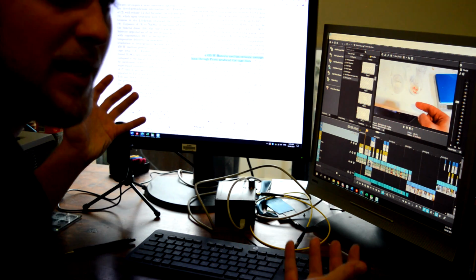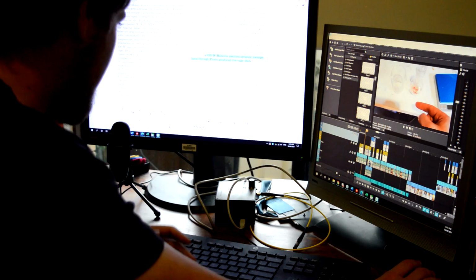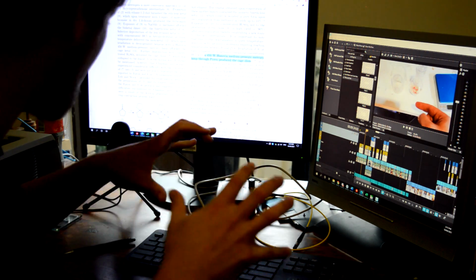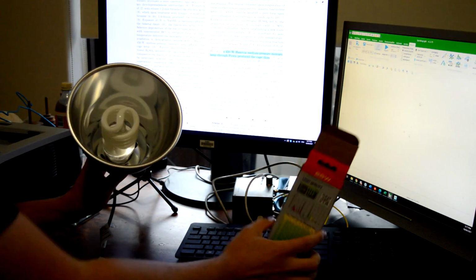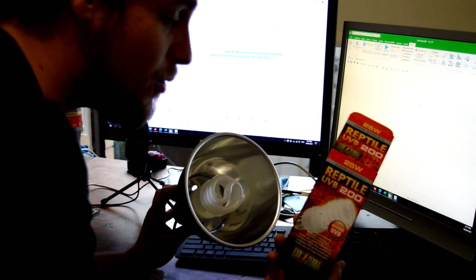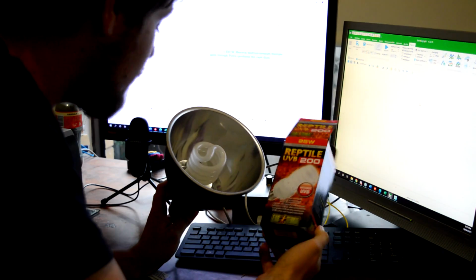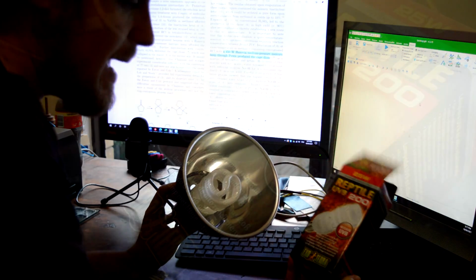So if everyone's using a medium pressure mercury lamp, then I suppose I should be using a medium pressure mercury lamp, but I don't have one. They're expensive. I don't know where I'm going to get one from. I've got a slightly nicer and more available source of UV. This here is a reptile lamp. It's not very high wattage, it's only 25 watts, which is nearly a 20th as powerful as the ones being used in the paper, because they're 400, 500 watt lamps.